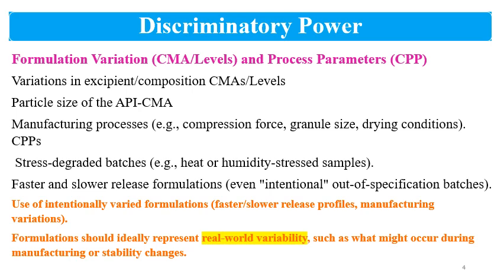Use stress or degraded batches for dissolution testing and see whether the method can detect the changes or not. Expose the samples to heat and humidity, or stress conditions, and perform dissolution.